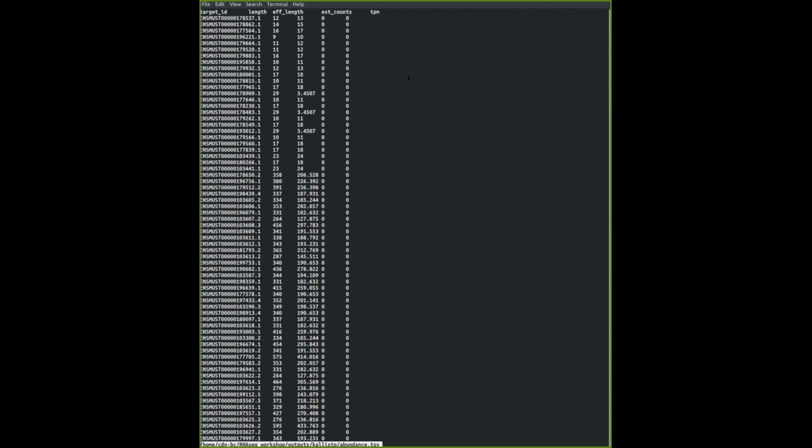It stands for transcripts per million, and it means what it says, which is the number of transcripts per million RNA in your sample, right? And you can see that a lot of the RNA or the transcripts have 0 count, 0 TPM, which is very normal for a single cell RNA-seq experiment, because number one, you do not have the same depth as a bulk RNA-seq sequencing. You do expect more transcripts with low expression, no expression at all.